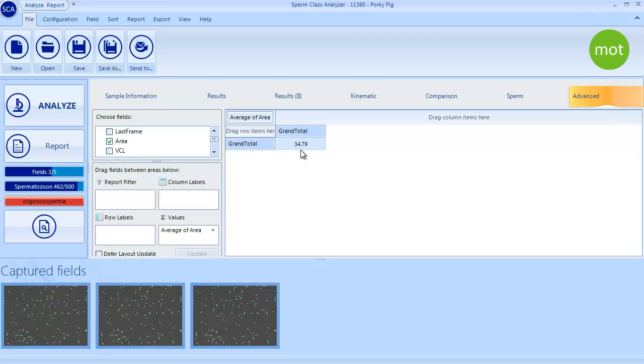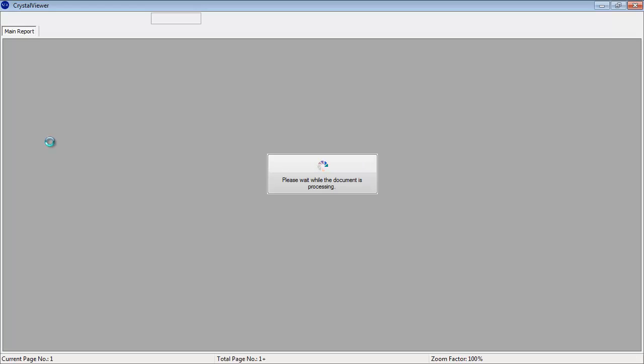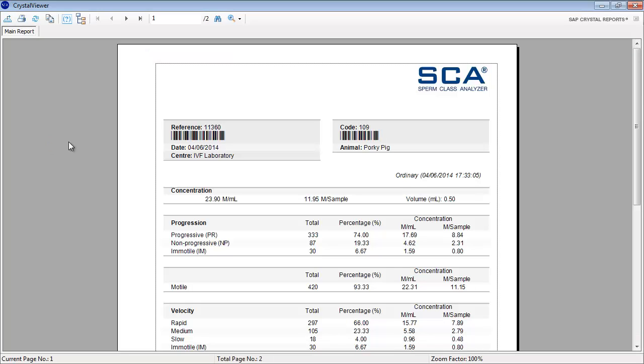It is very easy to access the analysis report, which can be exported to any format.